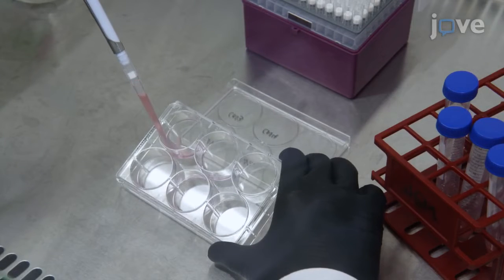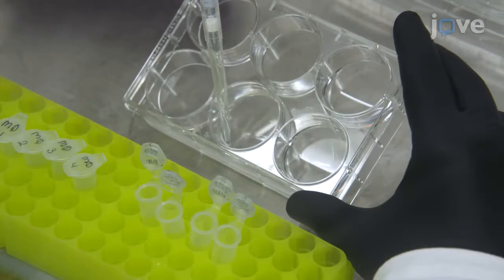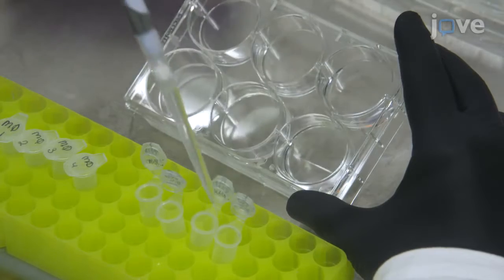Our protocol investigates fungal infection from both the host and pathogen perspectives to identify interactions between the biological systems that are critical for disease. We can detect both fungal and host proteins in a single experiment and identify fungal proteins only produced during infection, representing novel infection-associated proteins.